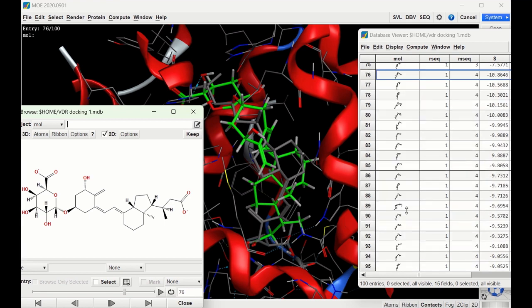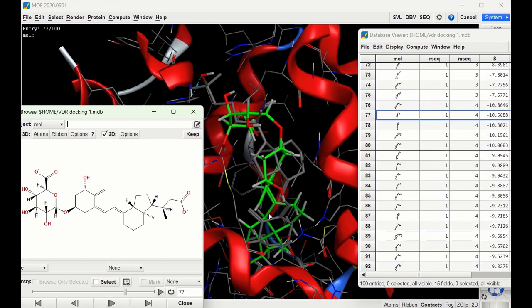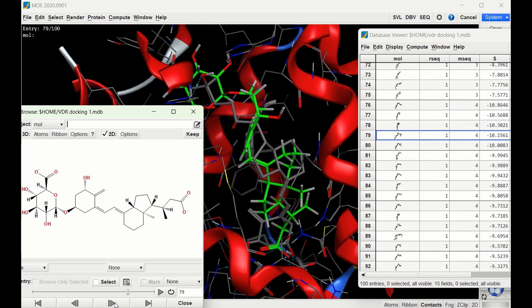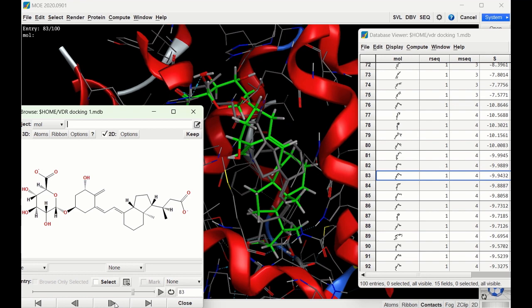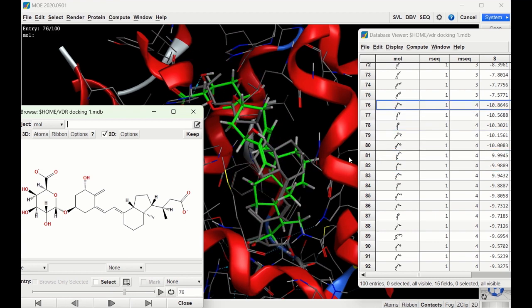For ligand four — the glucuronic acid derivative of calstroic acid — going through the poses, none of them give a very good configuration. That's not surprising: the large glucuronic acid group likely doesn't fit well into this particular binding pocket. Interestingly, the first pose does show a very good docking score, but that's probably not accurate given how poorly the ligand lines up. The carboxylic acid on the glucuronic acid is likely forming new hydrogen bond interactions that artificially inflate the docking score.